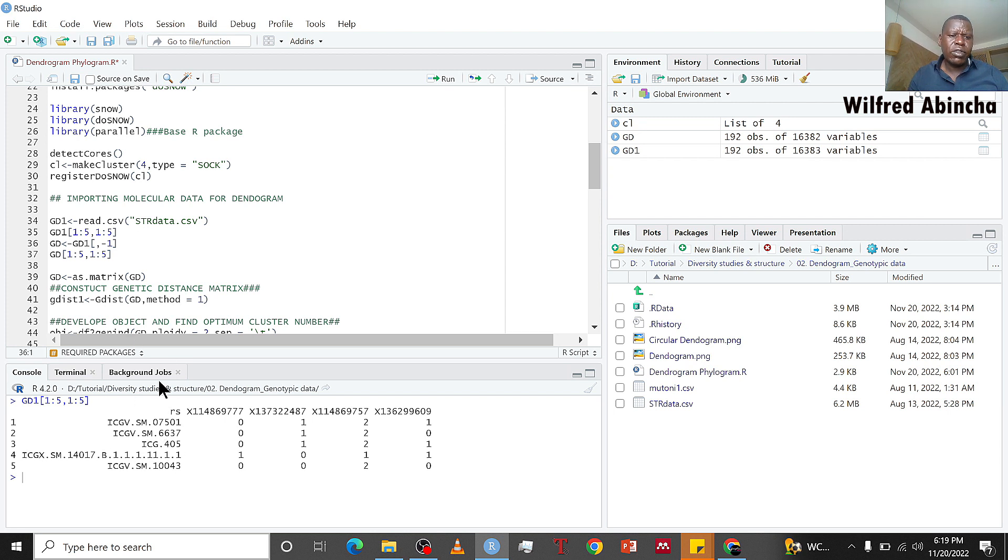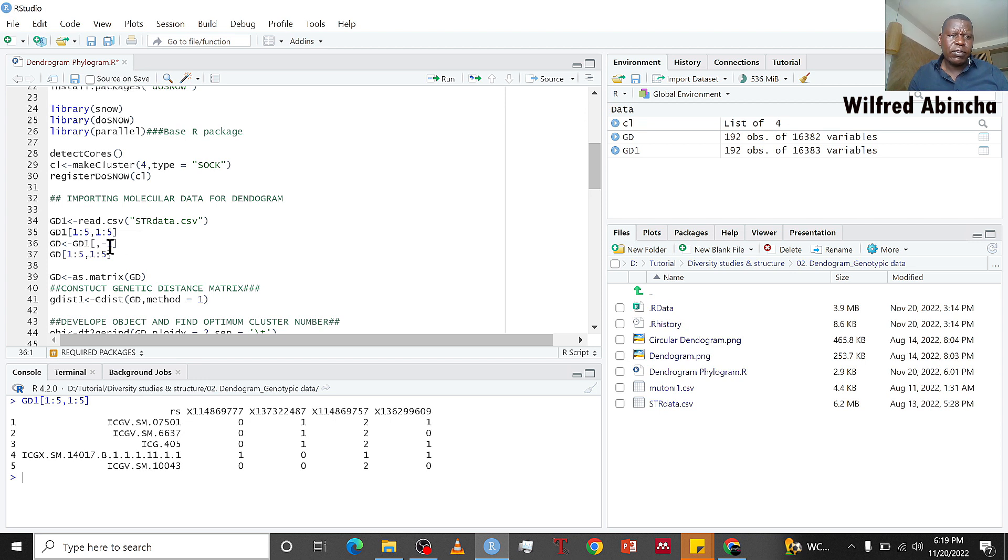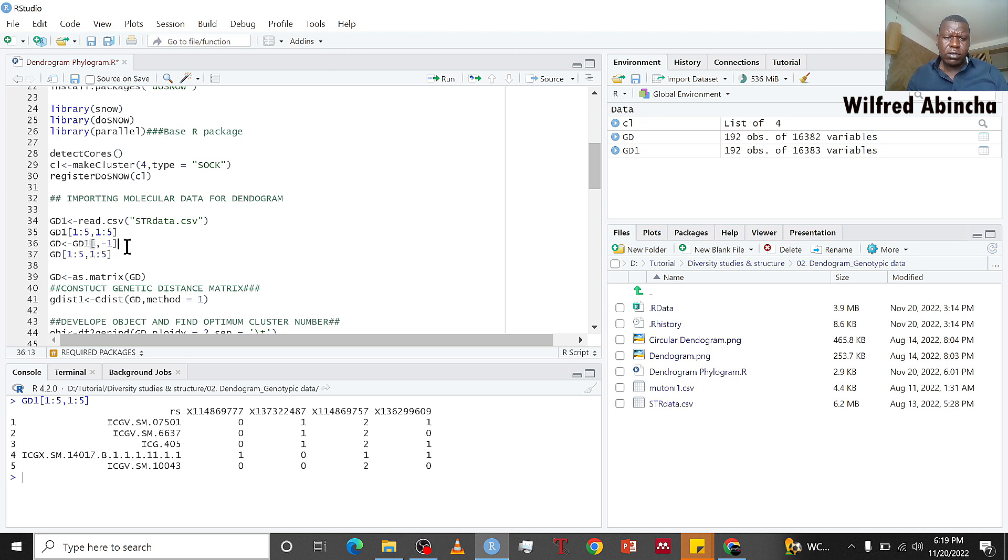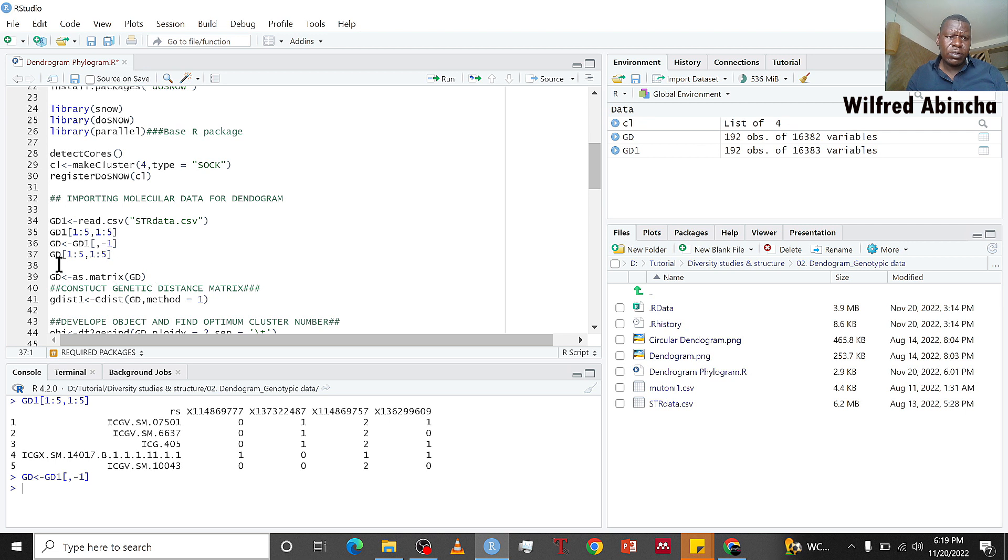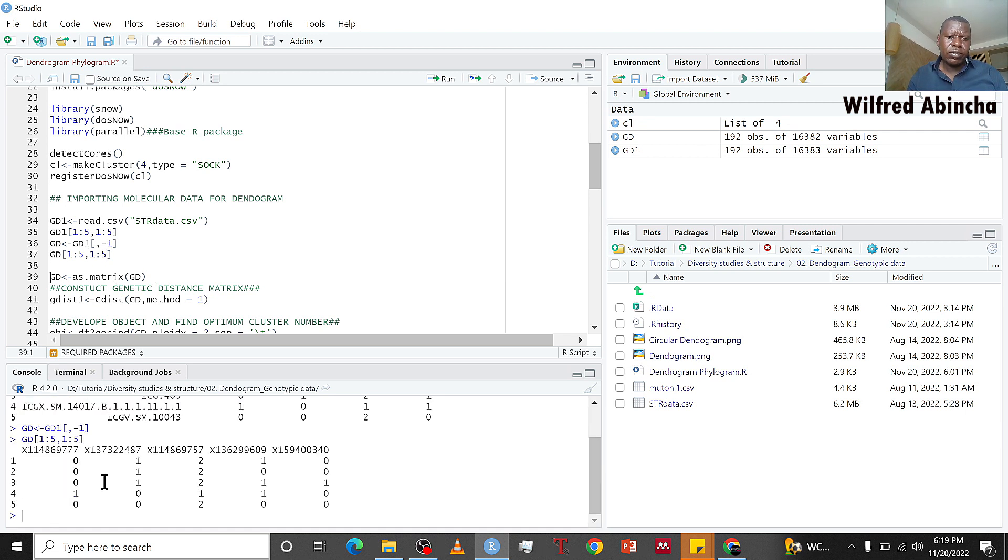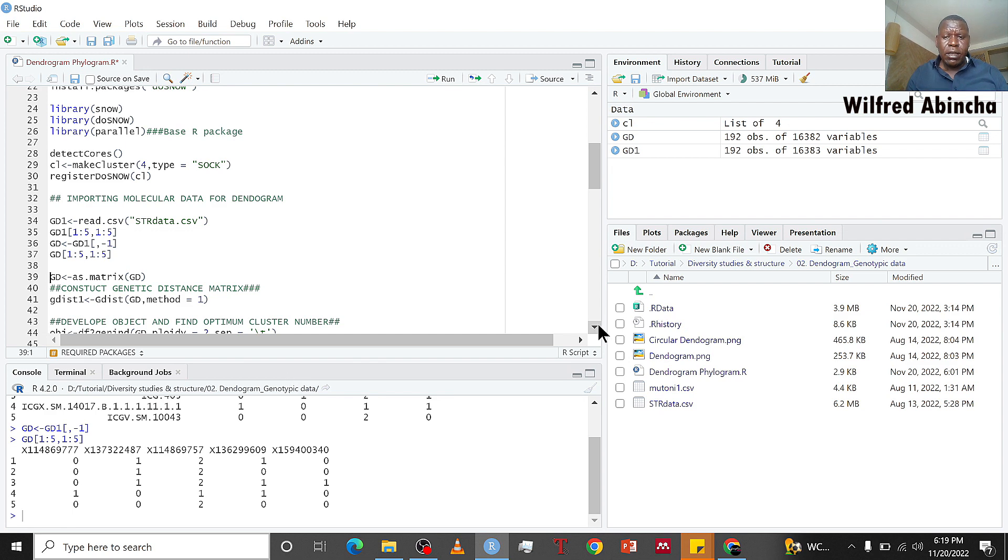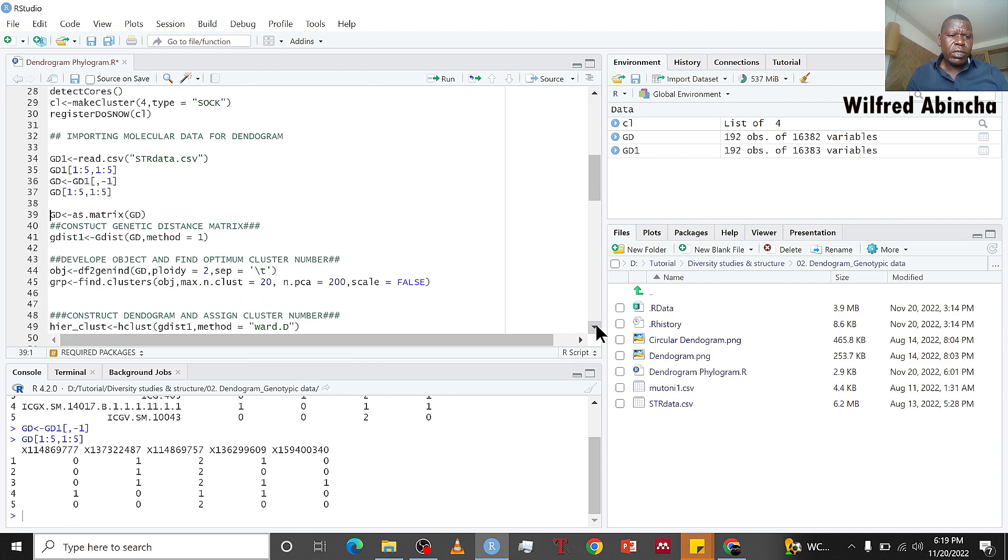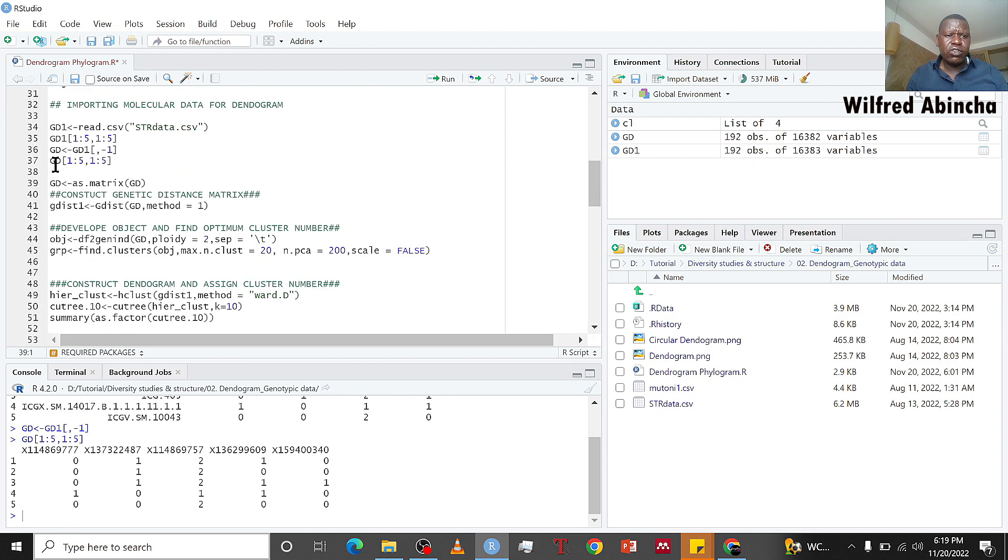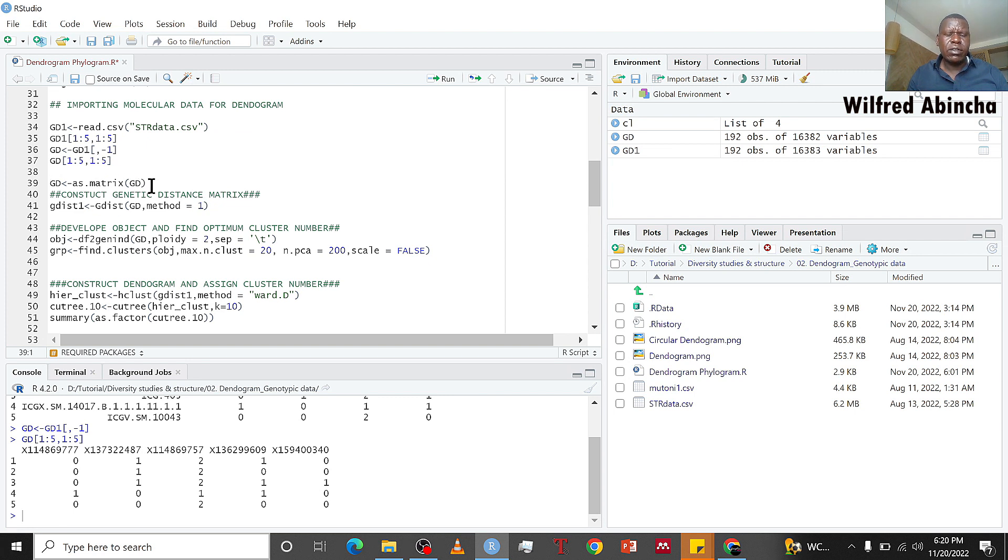In our work we don't need the names of individuals, so we remove them. This is the first column, so we are removing the first column using this command and call it gd. Next we want to convert our data into a matrix, so for this kind of analysis you convert your data into a matrix.